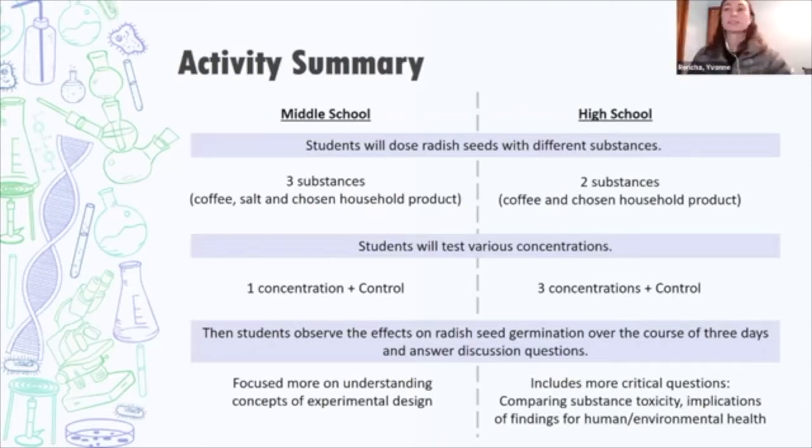Yeah, those are good questions, and I would second that. If you're running an experiment, it's always good to teach good laboratory practices. So definitely don't eat the radishes, especially because it's really easy to mix up what your treatments might be.